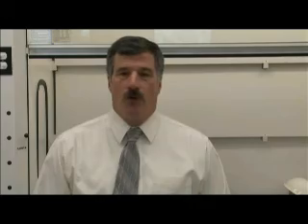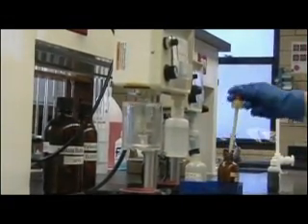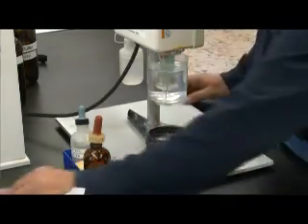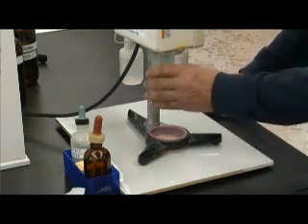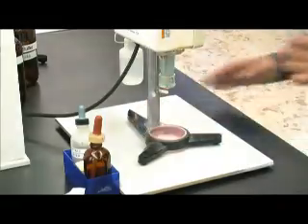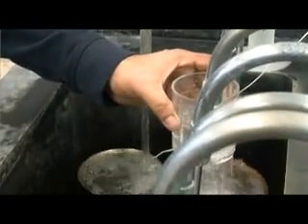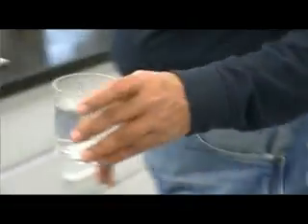The other major factor in water treatment is maintaining an appropriate chlorine residual. Chlorine is added as a disinfectant to neutralize any pathogens that might be in the water. The chlorine residual is monitored on a continuous basis using inline analyzers at both the beginning of the treatment process and in the finished water. The lab staff confirms these readings by testing samples from both of these sites on an hourly basis.